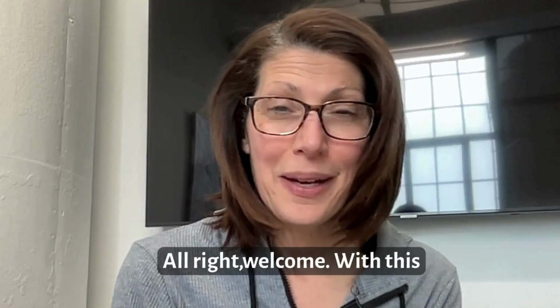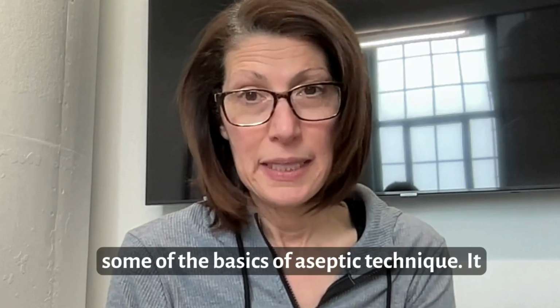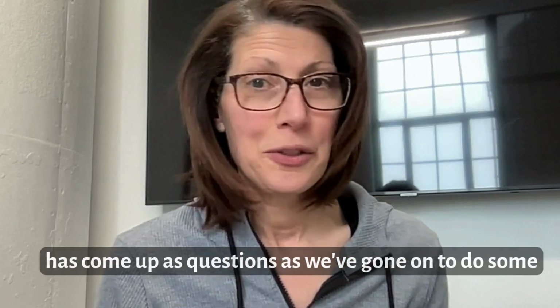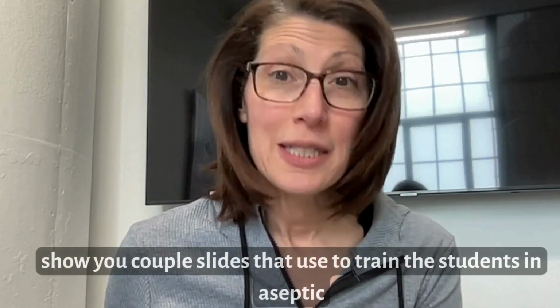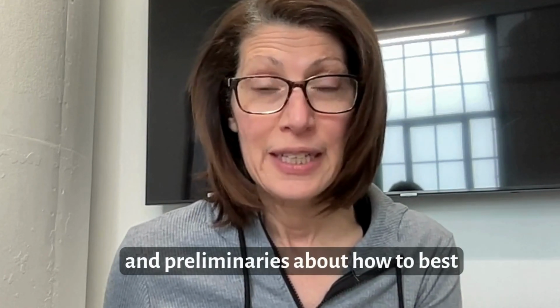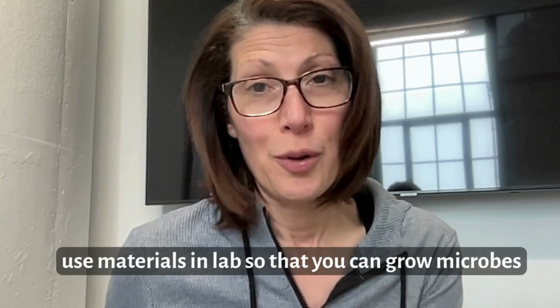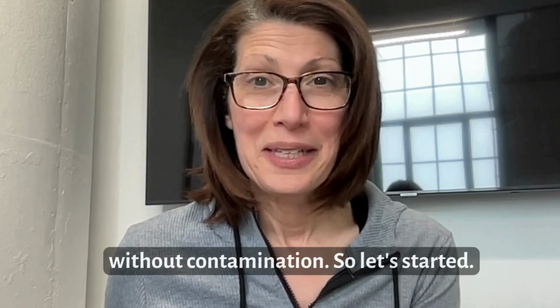All right, well, welcome. With this training video, I thought I would cover some of the basics of aseptic technique. It has come up as questions as we've gone on to do some teacher training with the BioTechBuilder curriculum. I'll show you a couple of the slides that we use to train the students in aseptic technique, and then I'll also cover some of the basics and the preliminaries about how to best use materials in the lab so that you can grow microbes and cells reliably and without contamination.